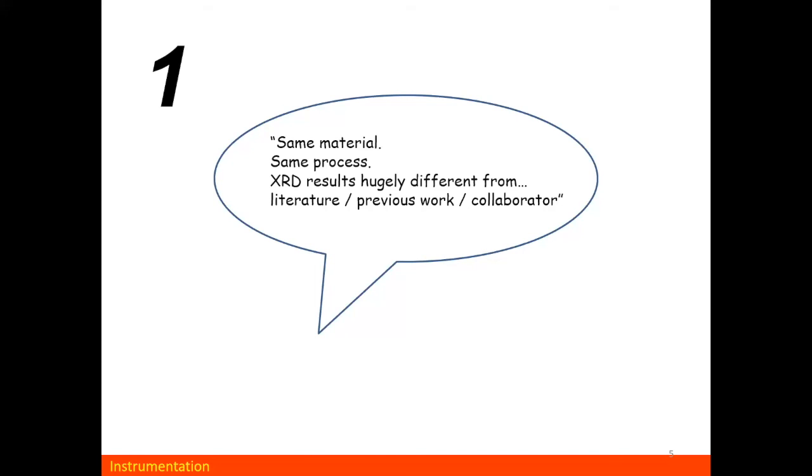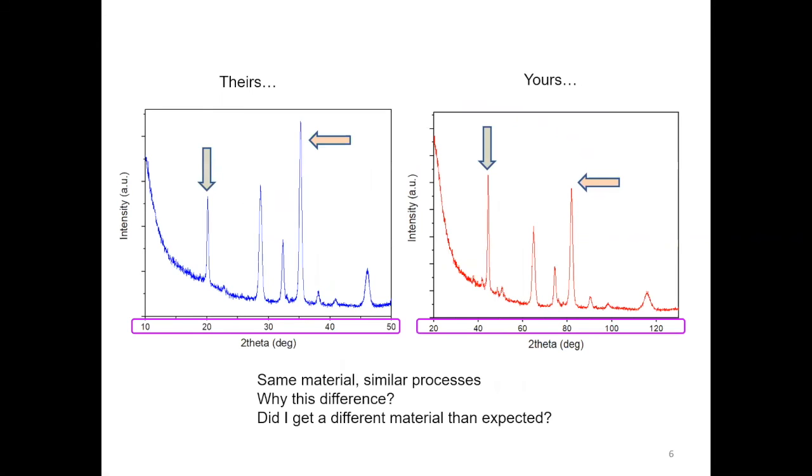To understand that, we need 2 concepts. The first one is the concept of reciprocal space. The need for that is because basically what you see coming out from the XRD data, like in this plot here, is a diffraction angle, the detector position, versus the intensity that's collected.